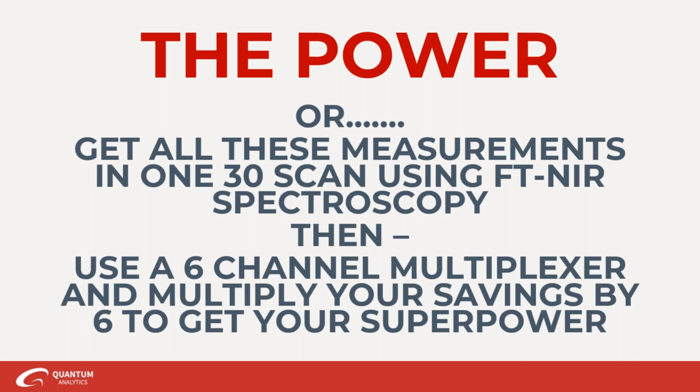And then your statistics are going to get better. Your R-squared might go up and your prediction error might go down. But then, using the model in practice, you may have removed a source of variability from the model, like something in the spectra that was changing for whatever reason, by pulling those outliers out. And then if you scan a sample to get a prediction that has whatever that source of variability is, it's not going to be able to predict it well.